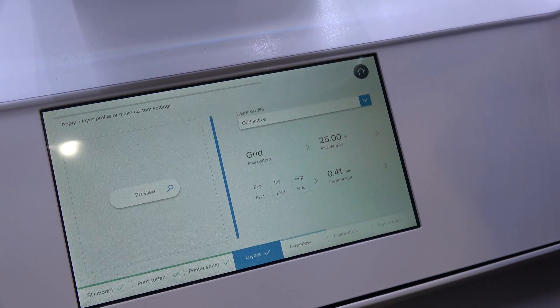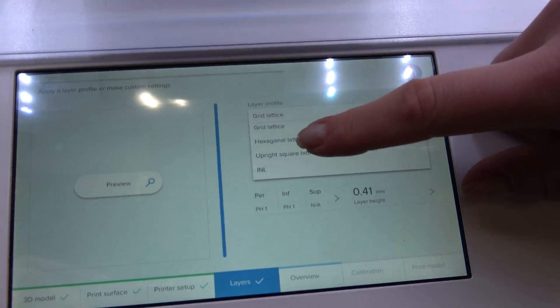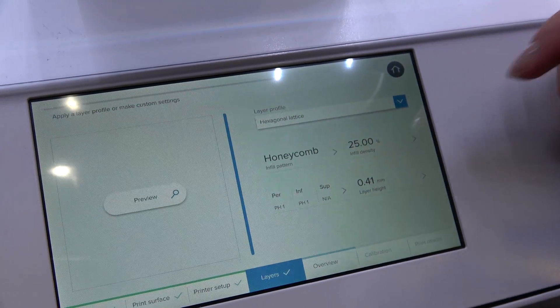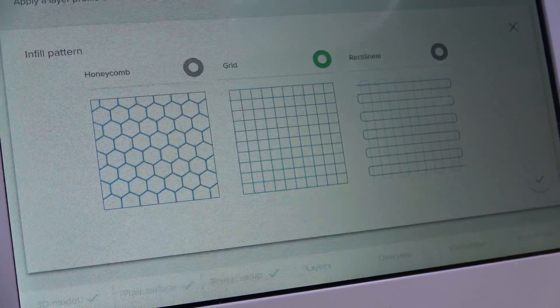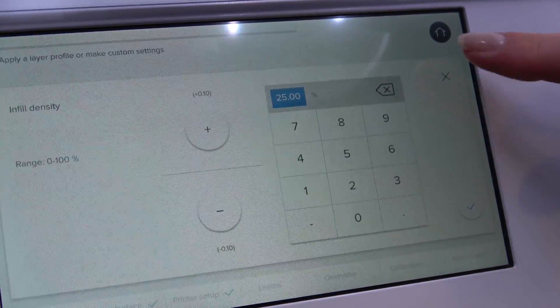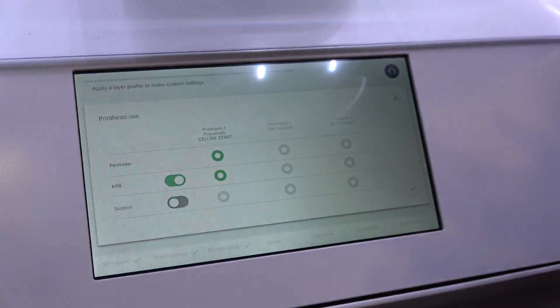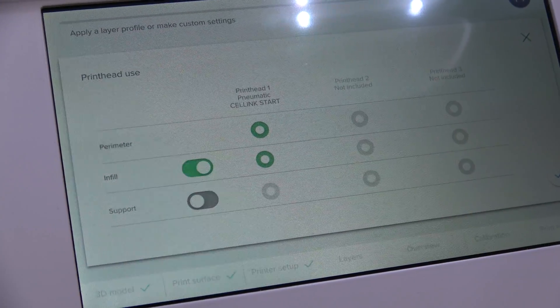We move on to the layers. You can choose to have a hexagonal or honeycomb structure, or for example a regular grid structure. You can also choose which print head you want to print which part of the structure — that's possible to do here as well.